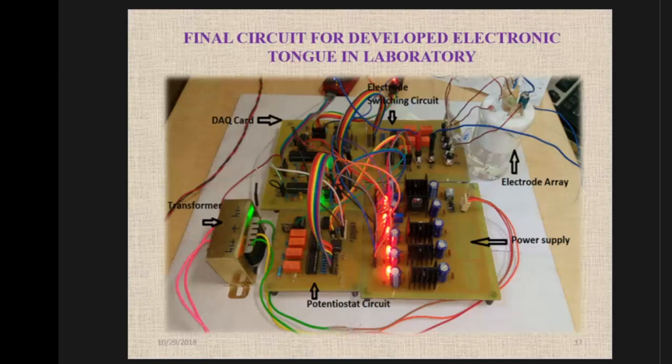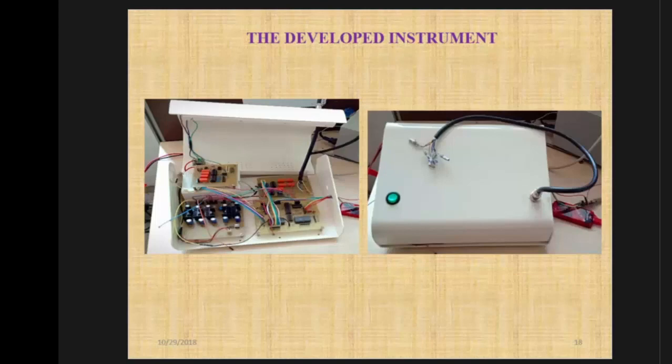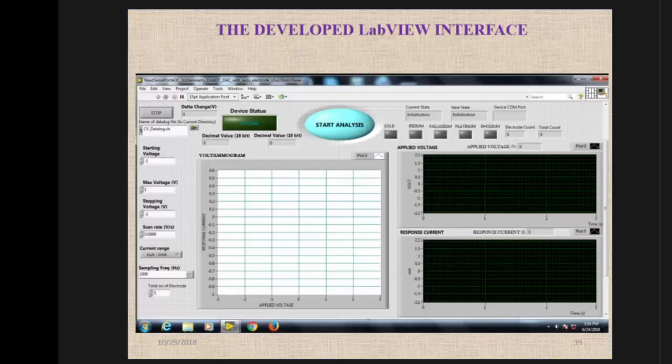This is the potentiostat circuit, the electrode switcher, and this is the data acquisition system. The instrument has now been put in the cabinet. It is a programmable interface. So this is the interface that has been developed in LabVIEW.